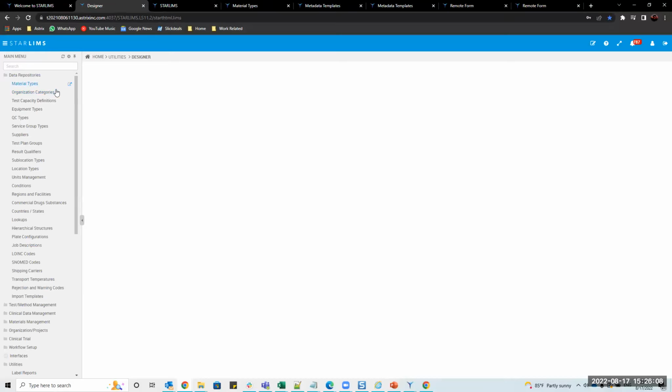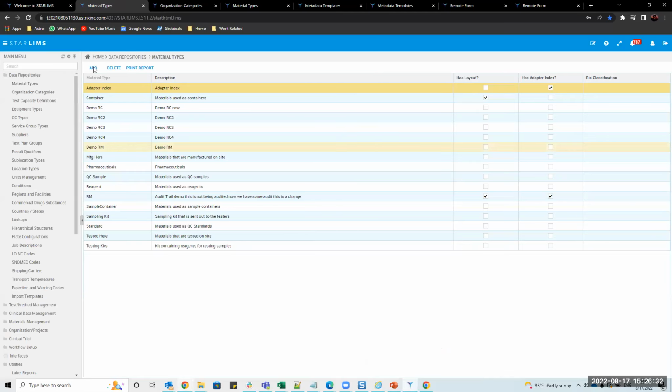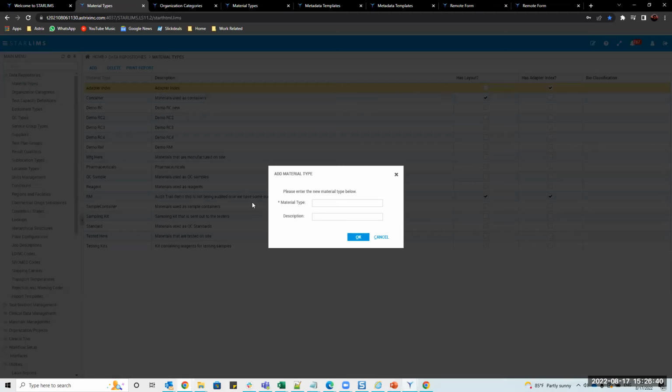So that it's what we read, right? It's gonna do an await, and you're just gonna sit there. And if the user never closes that form, then the program never runs anything else. It just stops. Let me show you this quickly. Yeah, so this is what we just read, right? So Lims.GetForm, ShowModalDialog with the await in front of it. And it's just waiting here. Okay, and then nothing else will happen.